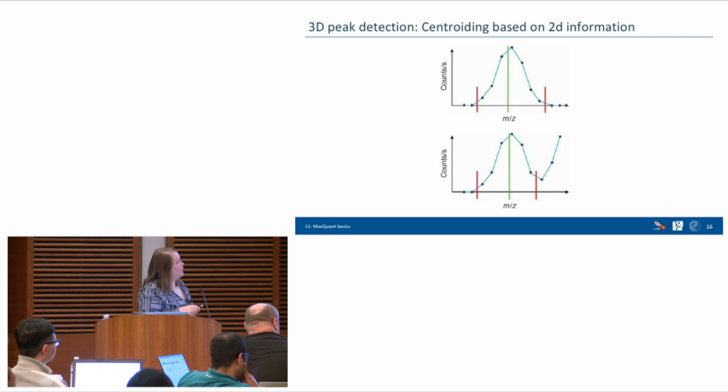Then you fit a Gaussian on the top of the most intense 3 or 5 points, and that's how you position your centroid. As for the intensity, you sum up all intensity of that curve, and this is the intensity of your centroid.